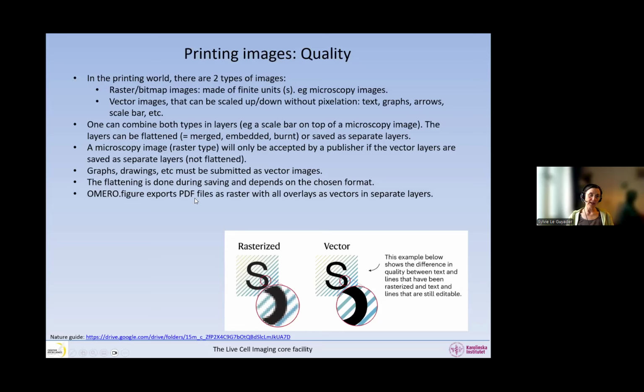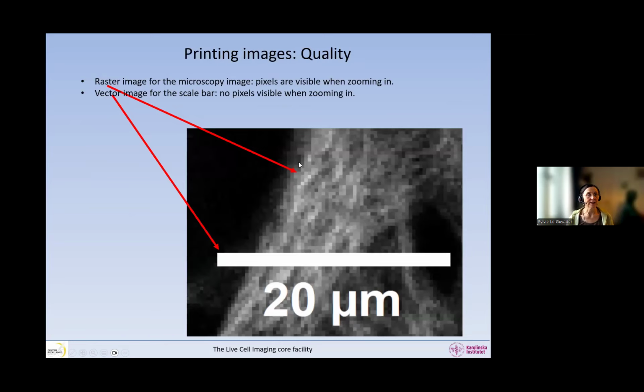OMERO.figure exports PDF files with the raster image and all the overlays as vector image. So the images that we are getting from OMERO.figure are perfect to send to publishers. In OMERO.figure, do not save as TIFF, because then it flattens the whole thing. Save as PDF files, then it's correct.